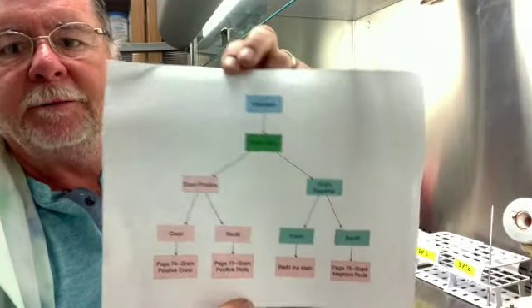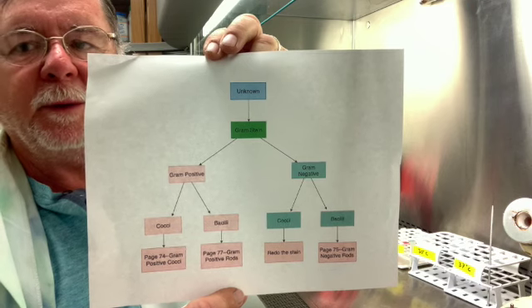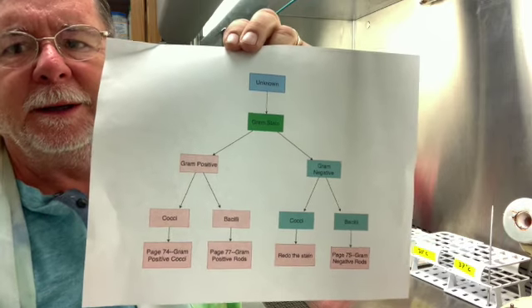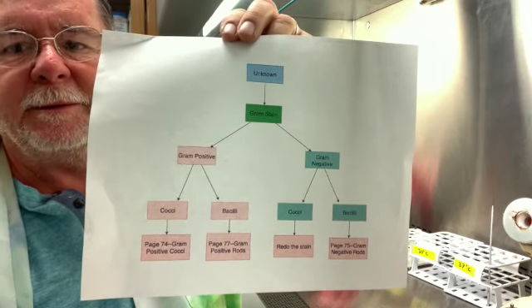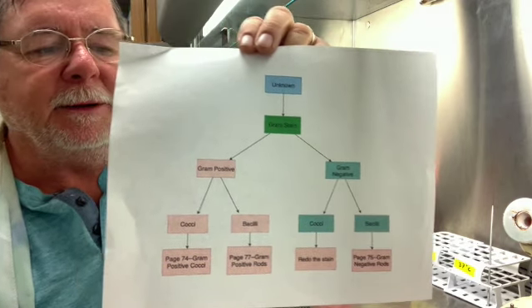Hi class, we're going to look at a tutorial on identifying bacteria as the unknown identification. So I created this flow chart here. You can work through it to see what your unknown is. We are working with 841 Bravo. You may get another one shortly, but 841 Bravo is your first primary bacteria. Think of it as a patient's specimen, and you have to diagnose what the bacteria name is and make sure that the doctor is going to treat it properly.